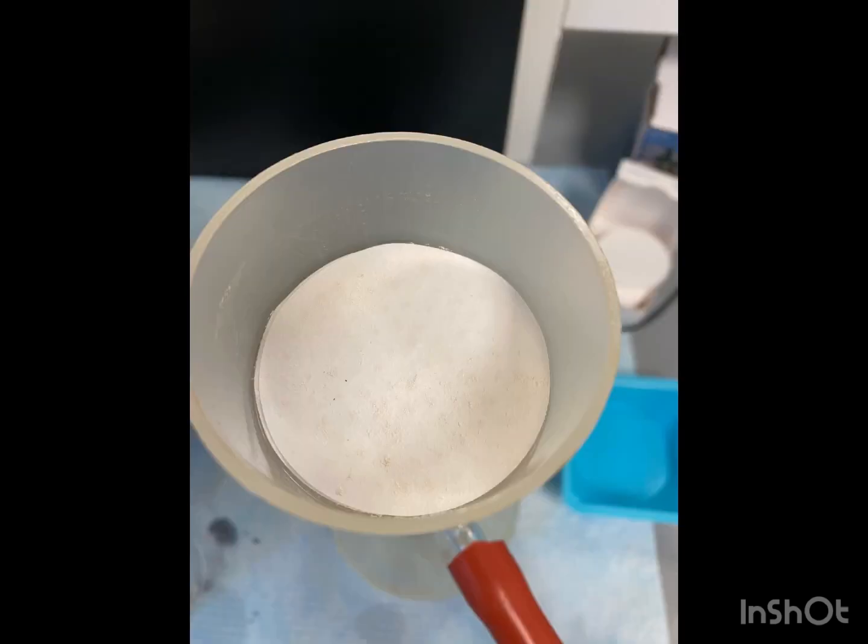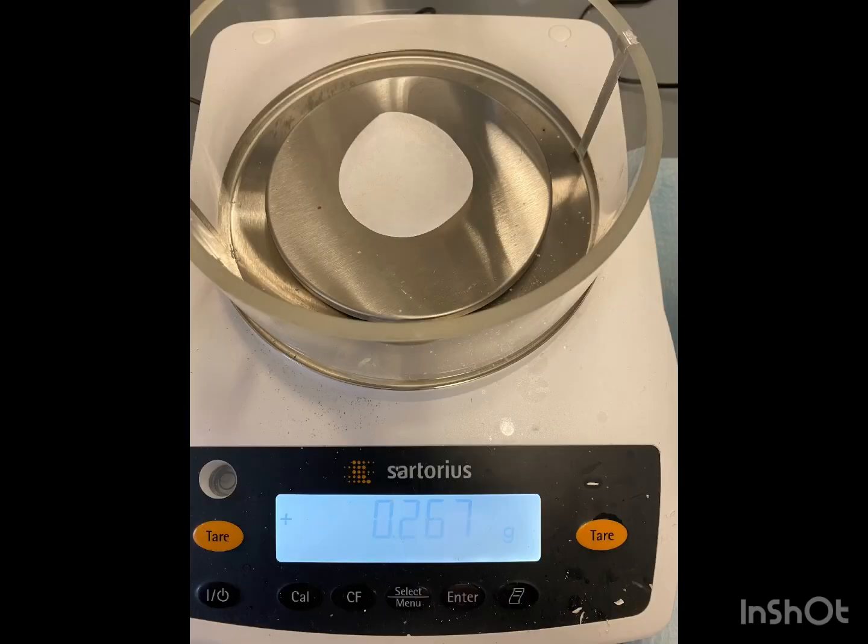Now that we have slowly acidified our solution, we are going to collect it using vacuum filtration, and we're going to rinse the product with ice cold 95% ethanol. We're going to leave it and let the solid dry on the vacuum. And here is our mass of our final product.